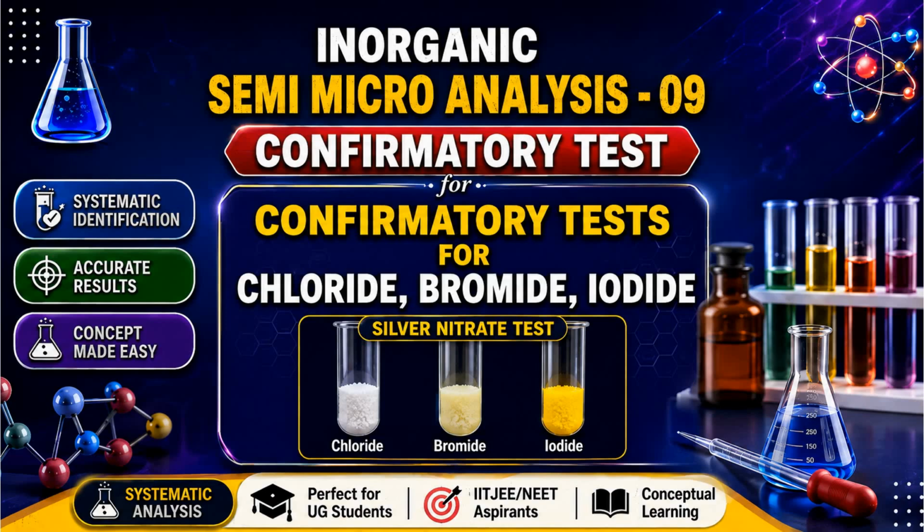In the dry test of the anions, we just guess the anion present. That means some rough idea of the anion. But through the confirmatory test only, we can confirm, 100% confirm which anion is present in the salt or this salt mixture.